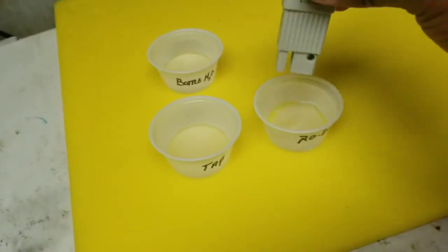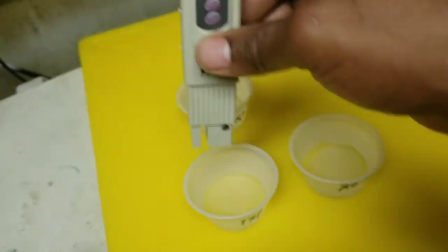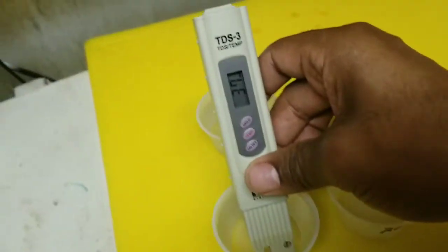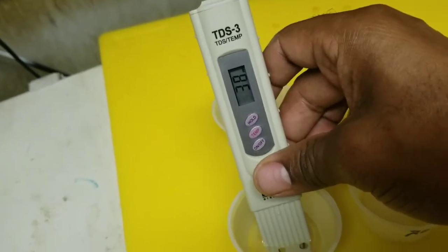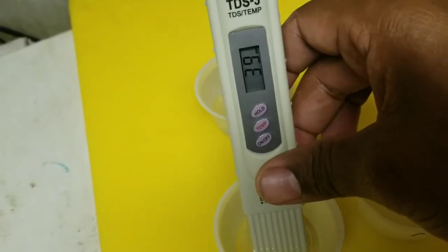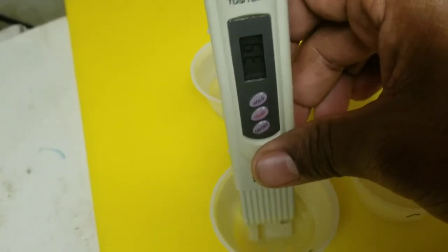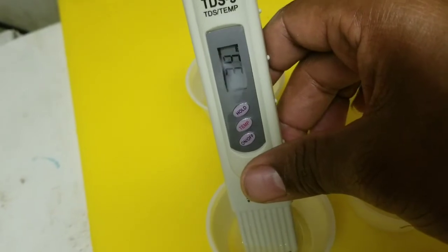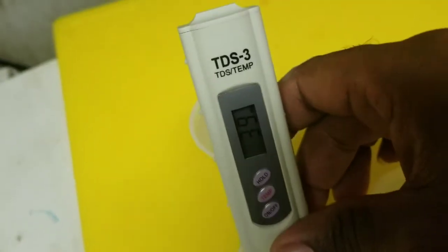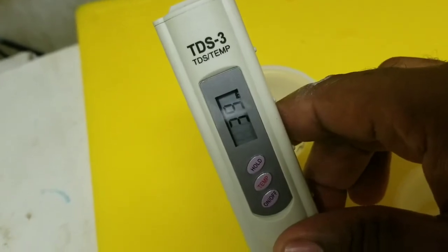Now let's test the tap water. I'm expecting a high number from the tap water, even though we got some pretty good water. New York has some pretty good water because our systems are really old and help with the filtration. But wow, look how that TDS jumps from 0 to 39. Is it still going up? You want to stir it around a bit, make sure you get an accurate reading. 39.